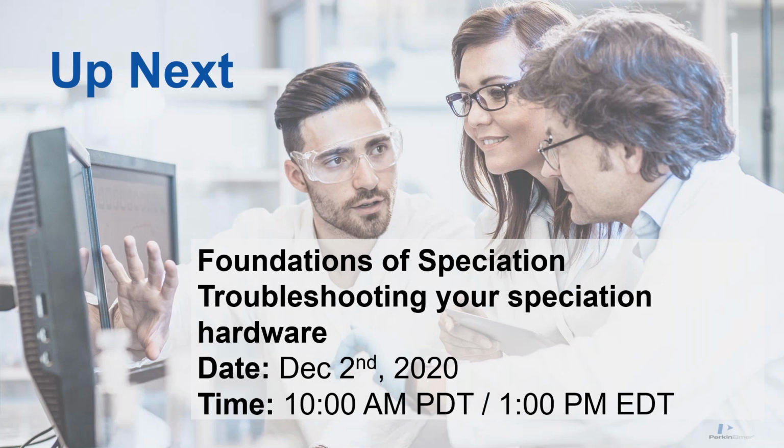Another question: can this be used on up to 8,000? Yeah, it can be used on any PerkinElmer ICP. Yep.